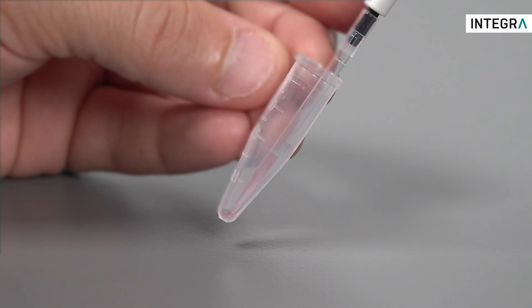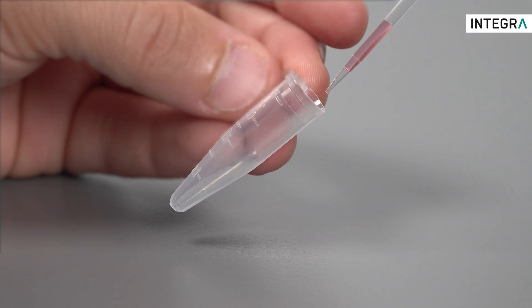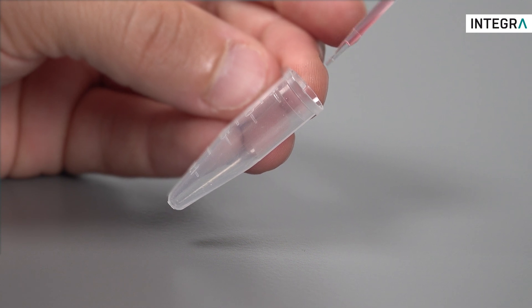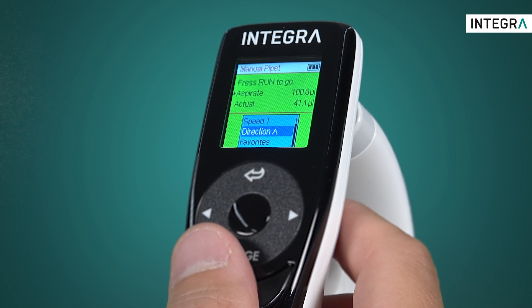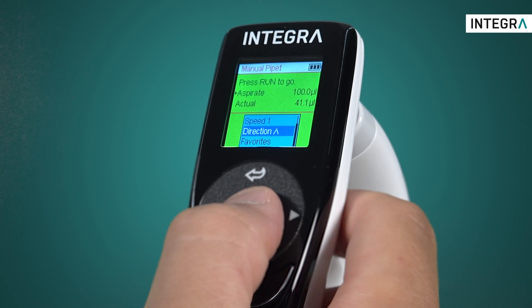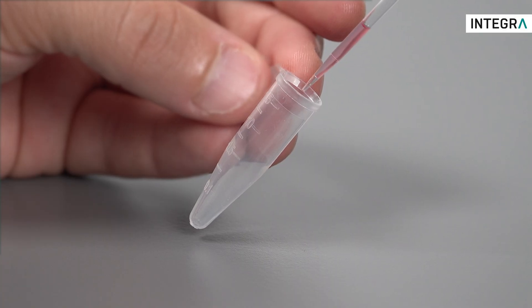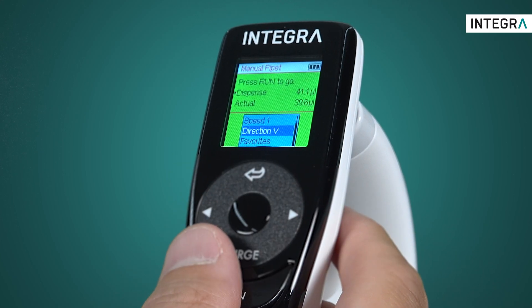An absolutely great advantage of this mode is using it to measure the volume in a plate or tube. Here the tube has been completely aspirated and there is air in the tip. The screen shows how much liquid has actually been aspirated including the air. If we reverse direction of pipetting to dispense, we can dispense until the air is completely out of the tip, and the screen shows us exactly how much liquid is in the tip.